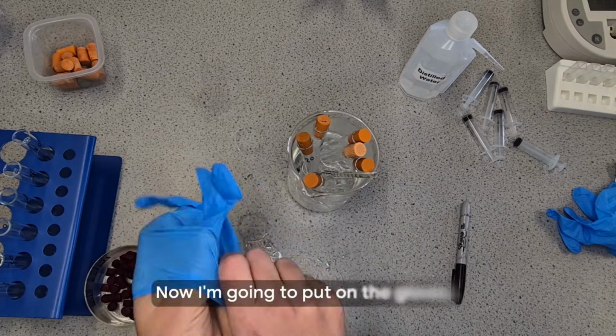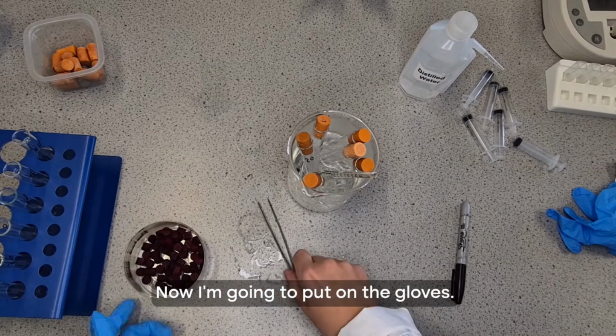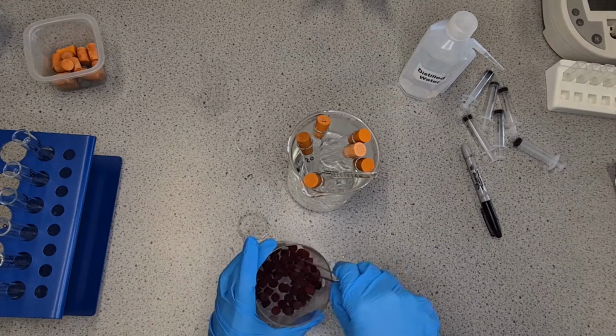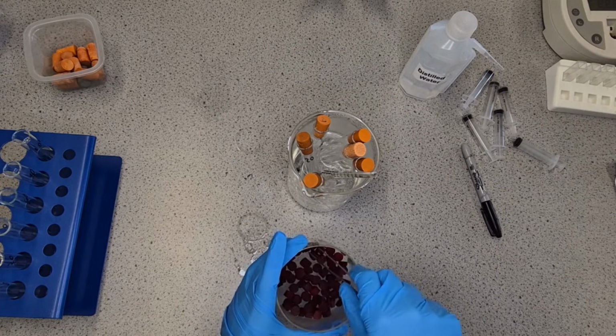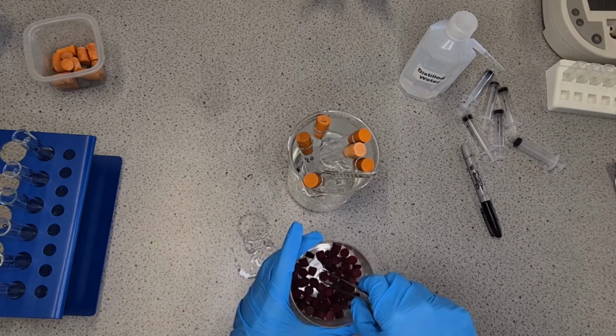Now I'm going to put on some gloves before the beetroot comes out. Even though I'm going to be using forceps, I'm still going to put gloves on just in case so I don't get stained red. And we've got a selection of beetroot discs here. So we've got 6 test tubes. Depending on how much they have will determine how many pieces you can put in. I can actually see here already though, some of these are not exactly the same size.